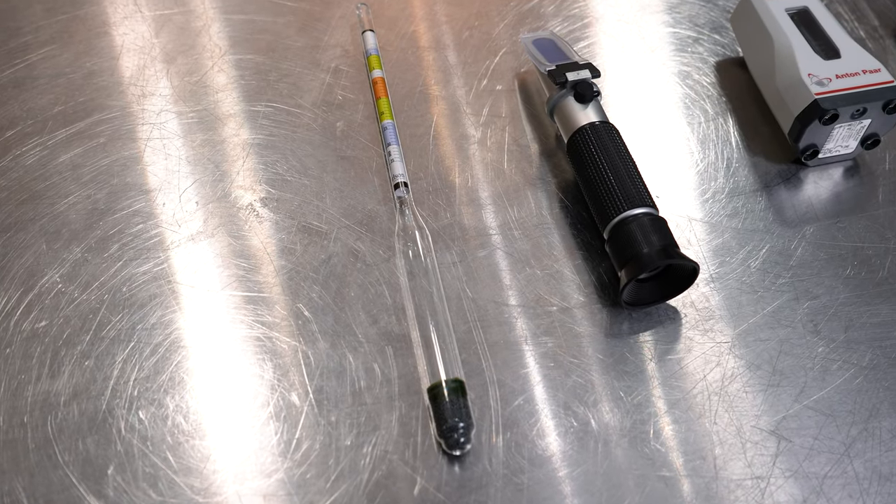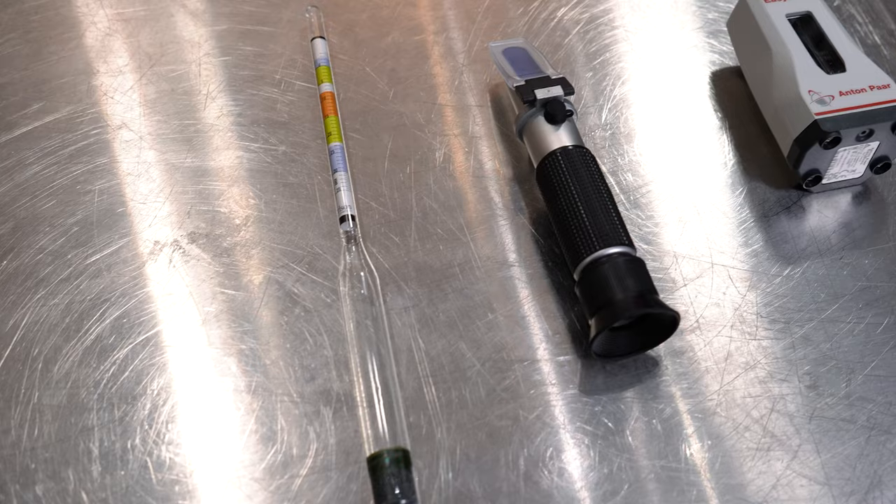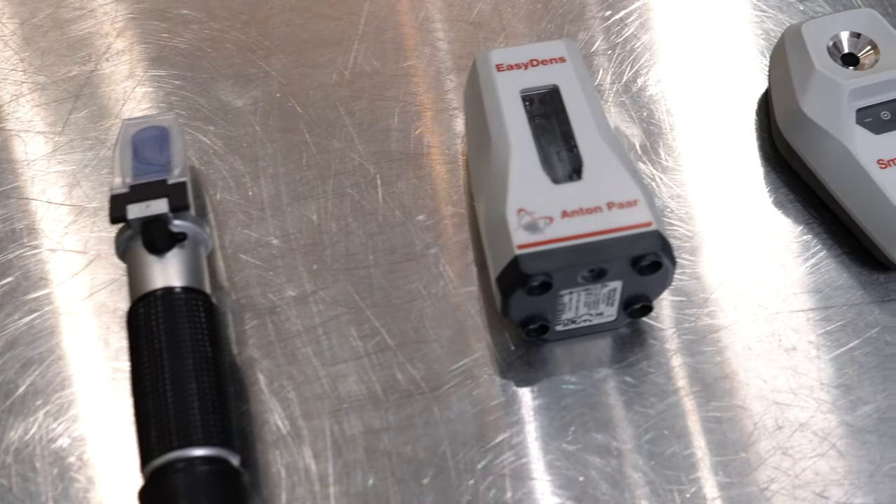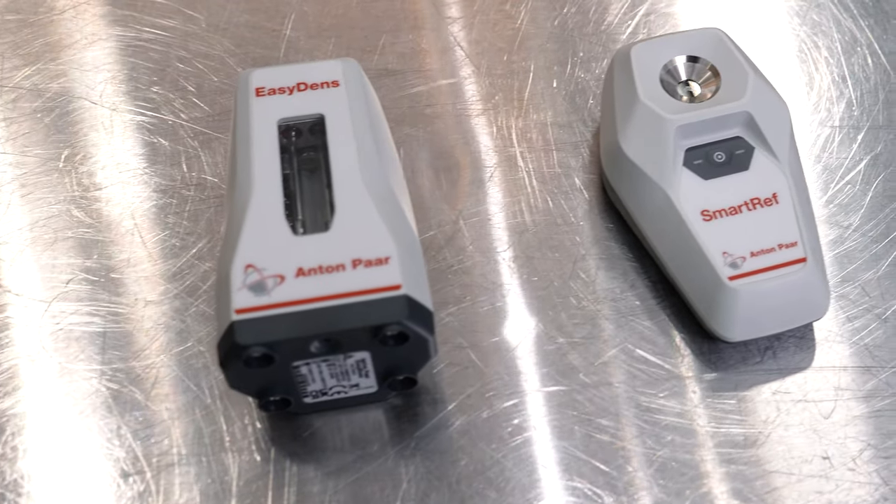There are several ways to measure alcohol content. In this video I'm going to show you four. Specifically, I'm going to show you how to use a hydrometer as well as how to use a refractometer, and as a bonus I'm going to show you how to use the new digital hydrometer and a new digital refractometer by Anton Parr. But before I get started I want to quickly give you some background information so this all makes sense.